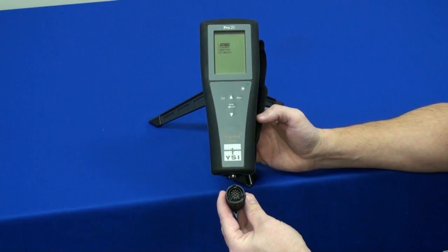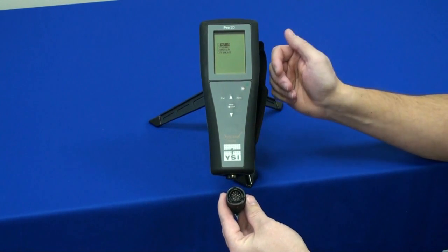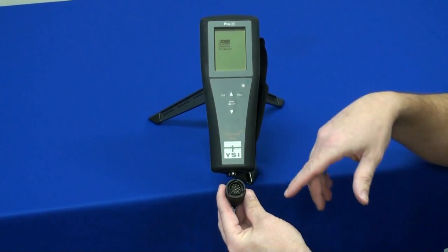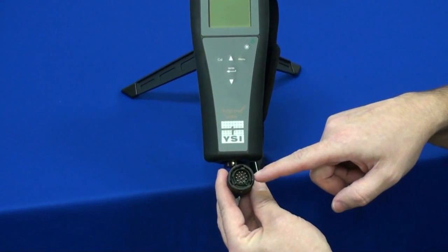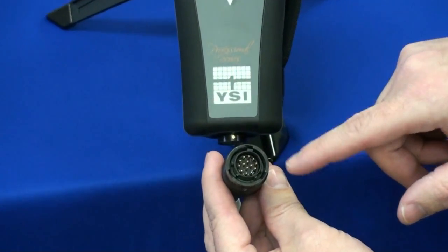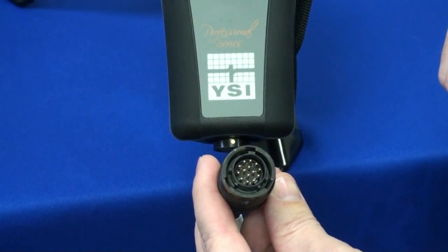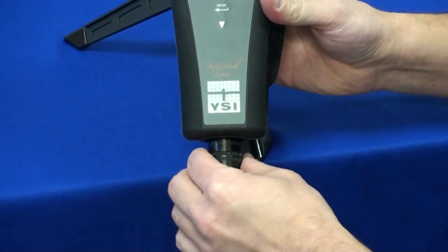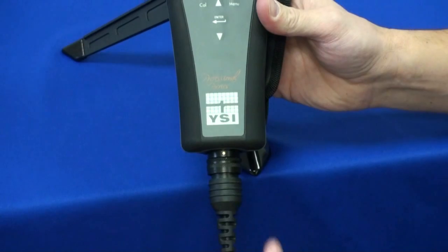I'm going to install the cable assembly and do the initial setup on the Pro 20 instrument. As you can see, the cable assembly is keyed so it only screws in one way. We'll go ahead and install that, twisting it until it locks into place.